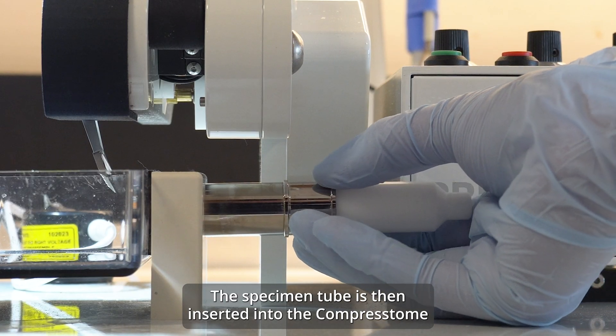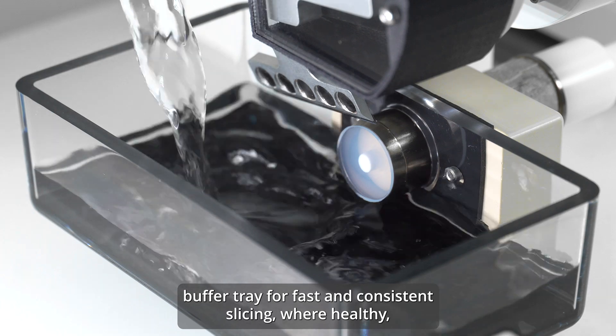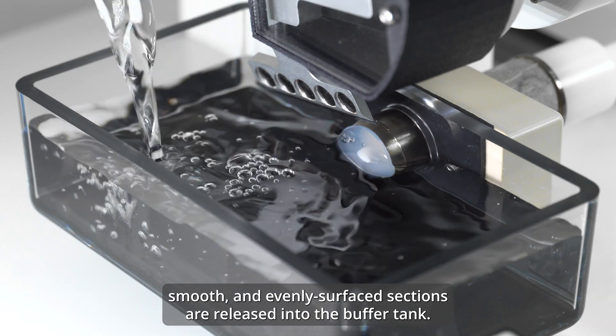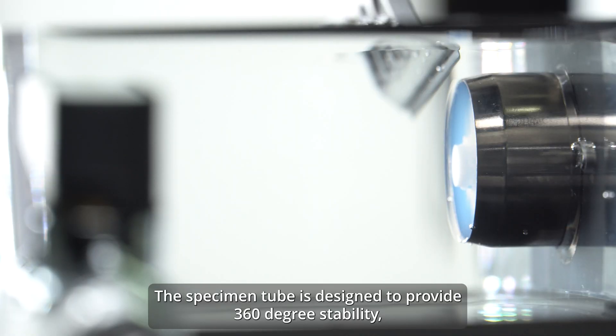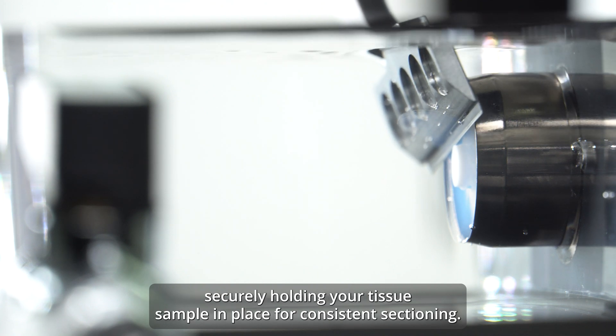The specimen tube is then inserted into the Compresstome buffer tray for fast and consistent slicing, where healthy, smooth, and evenly surfaced sections are released into the buffer tank. The specimen tube is designed to provide 360-degree stability, securely holding your tissue sample in place for consistent sectioning.